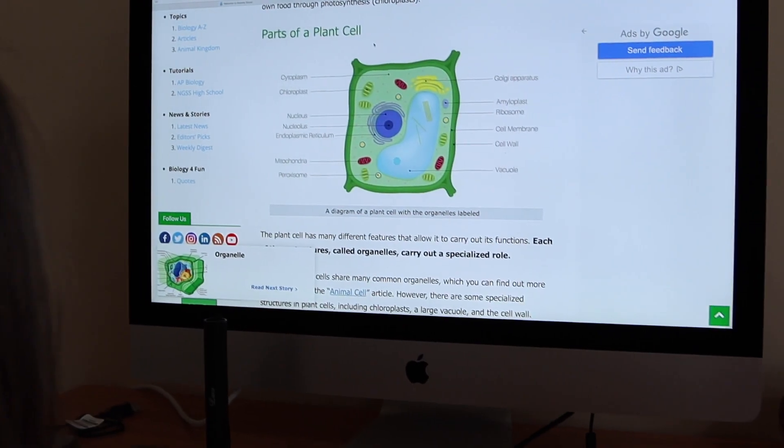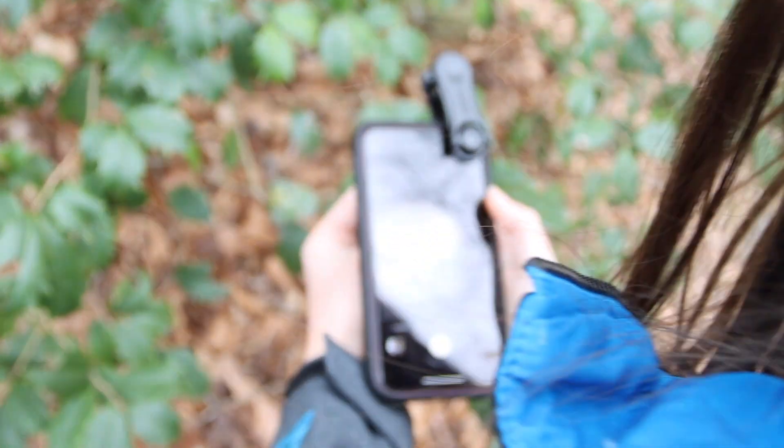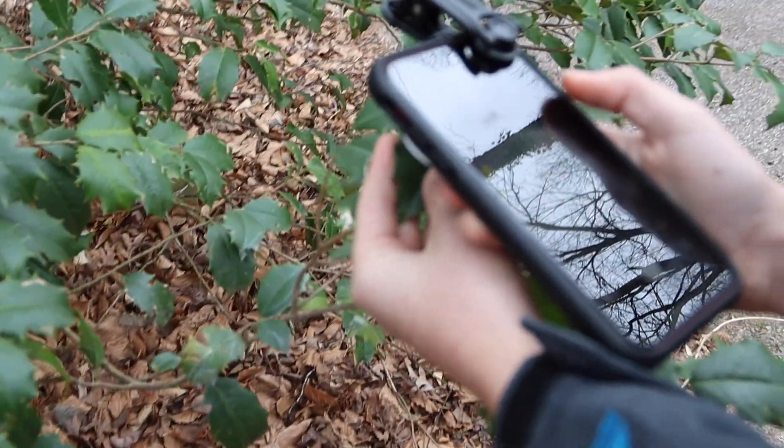So using this $20 attachment, you can actually see individual plant cells from an onion. Maybe I'm a little biased because biology was always my favorite subject, but to be able to use your phone and show your kids the actual building block of life — to take their learning from the textbook and transition them to something as simple as their phone or iPad where they can actually see the individual cell itself — that's remarkable.